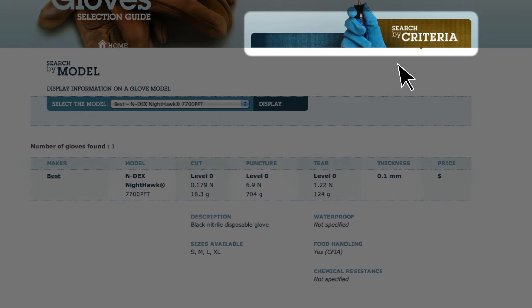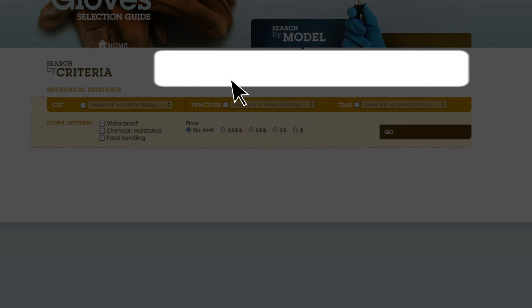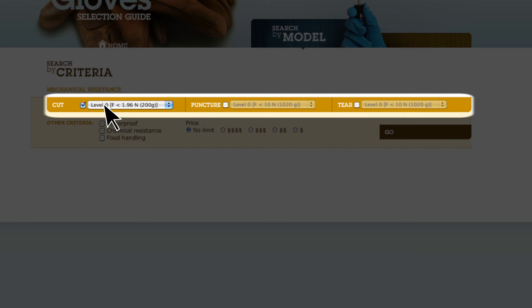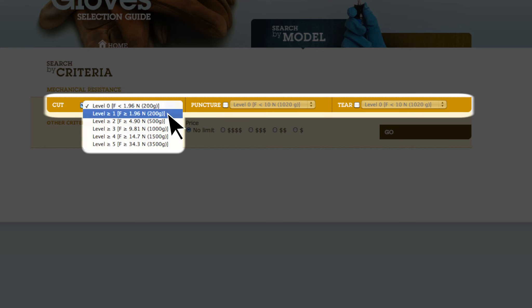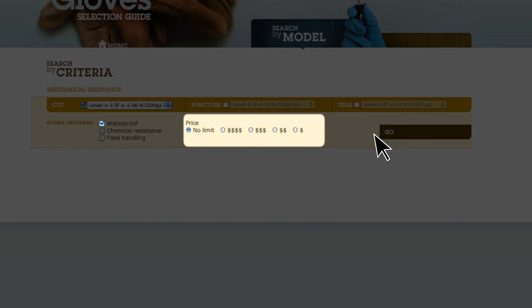If we do a search by criterion, we choose first the mechanical resistance criteria and the desired performance levels. Then the search can be limited by other criteria such as waterproofness, chemical resistance, food handling, and costs.